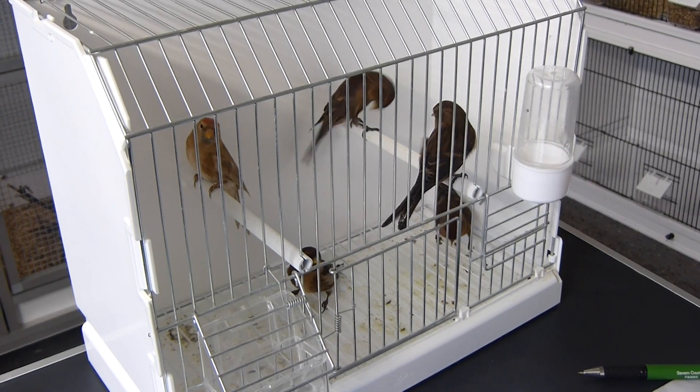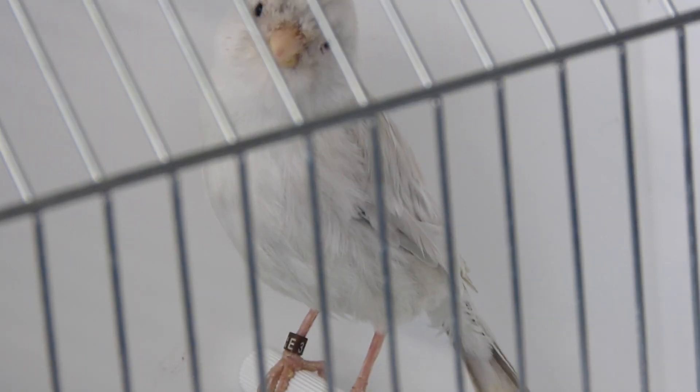These are some young redpolls that we're going to DNA sex. I've also got some young canaries that I'm going to be DNA sexing because I haven't seen them vent sexed yet and I'm really not convinced if they are cocks or hens.